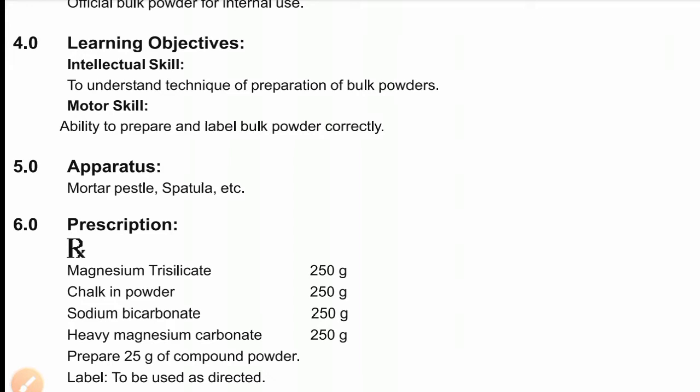The motor skill you have to develop in this experiment is that you should be able to prepare and label bulk powder correctly. You have to prepare a bulk powder and label it. The apparatus required are mortar and pestle, spatula, etc.